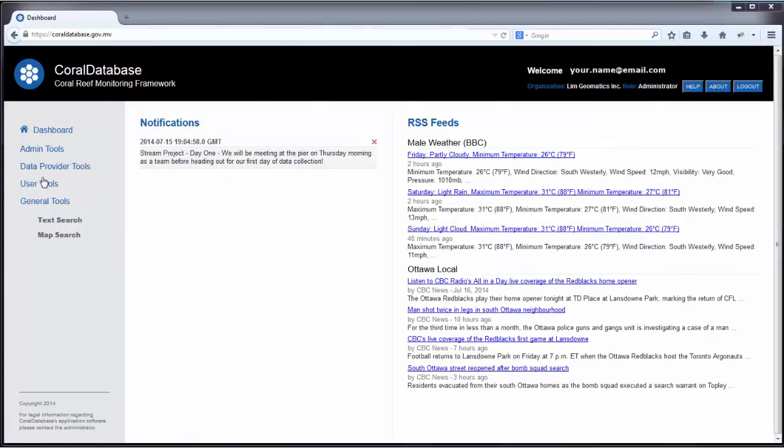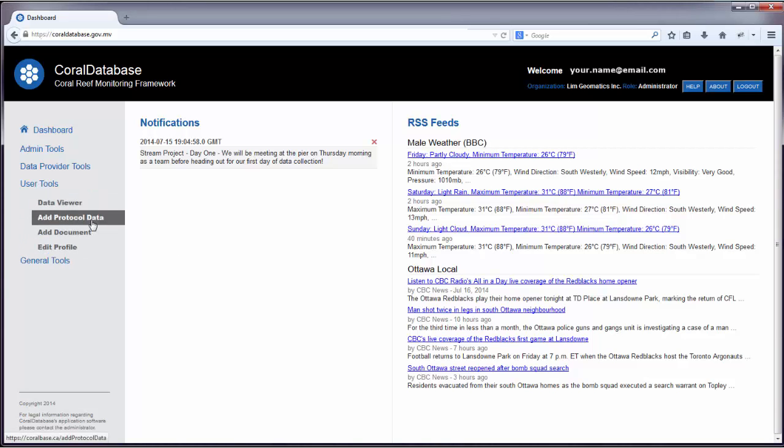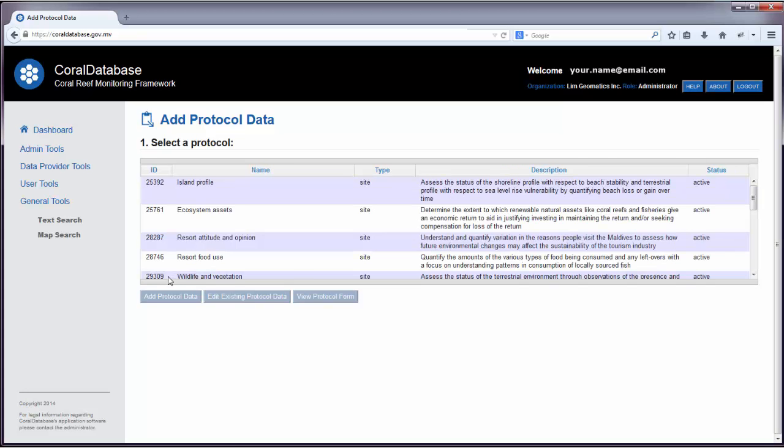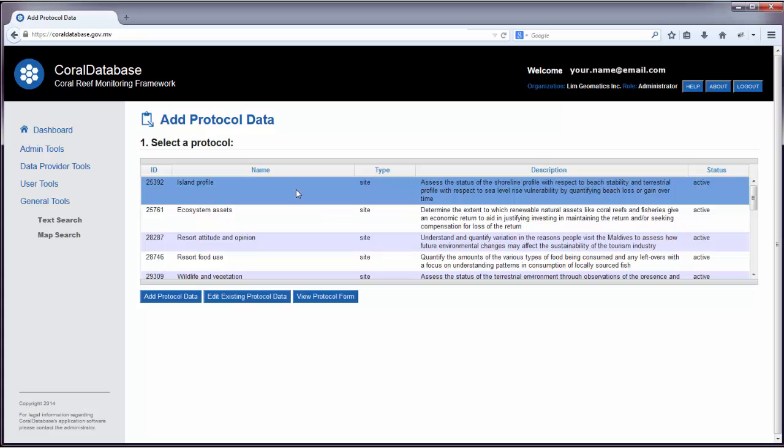To enter data into a protocol, expand the User Tools menu and click on the Add Protocol Data button. Select the protocol that you want to enter the data into and click on the Add Protocol Data button.